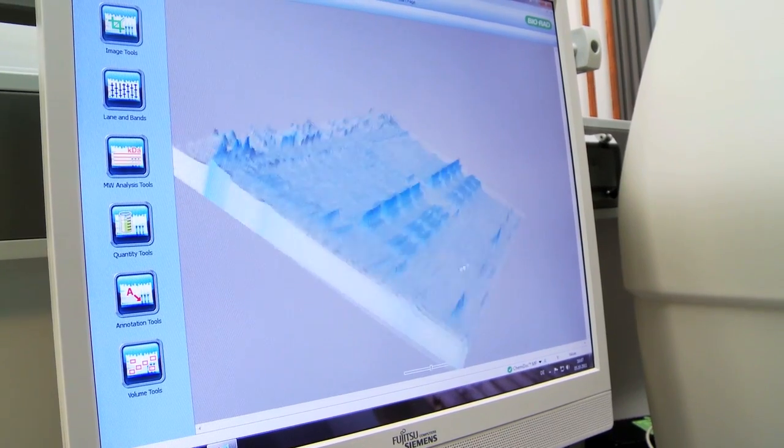So the really good thing about this system is I can take one blot I got from one animal and I can show all the proteins I'm interested in, in one lane, on this machine.